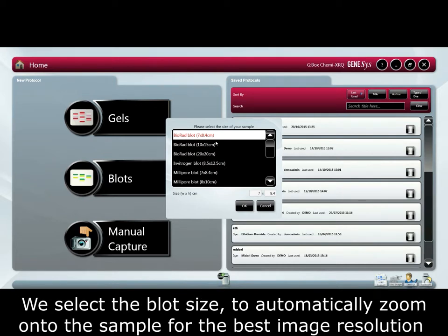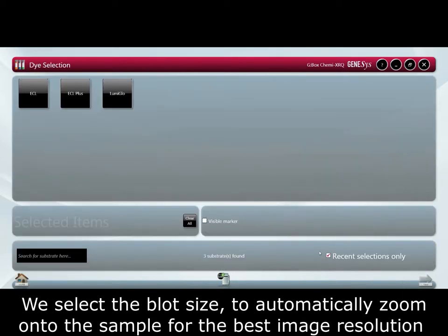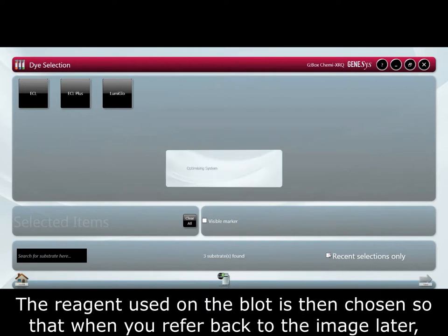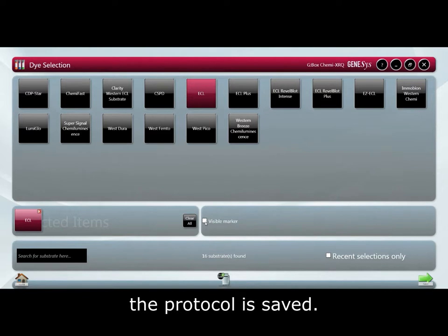We select the blot size to automatically zoom onto the sample for the best image resolution. The reagent used on the blot is then chosen so that when you refer back to the image later the protocol is saved.